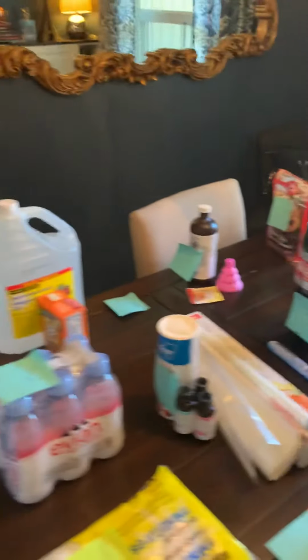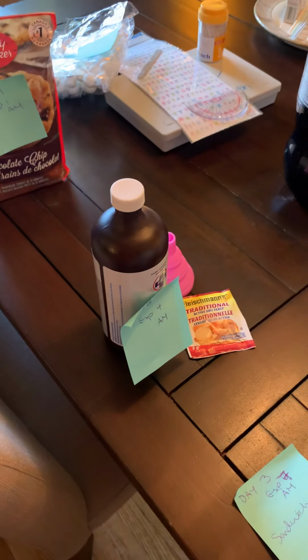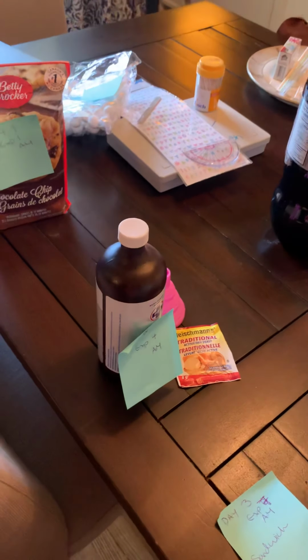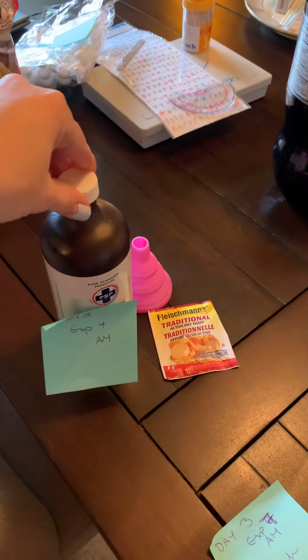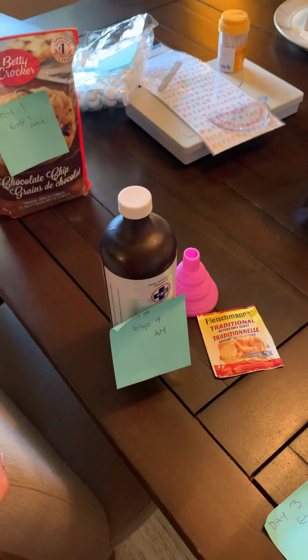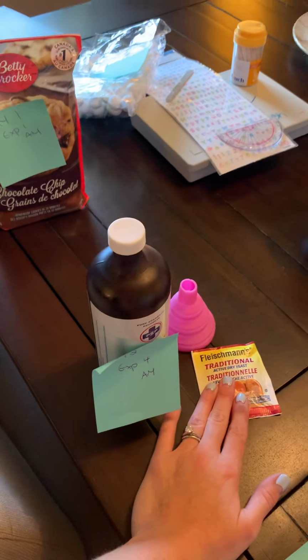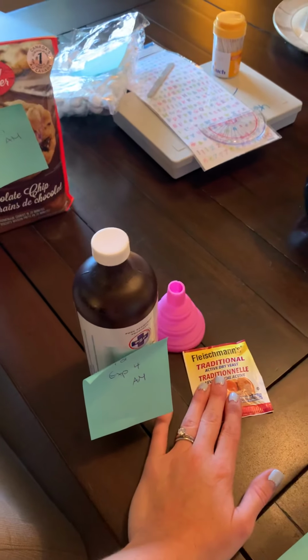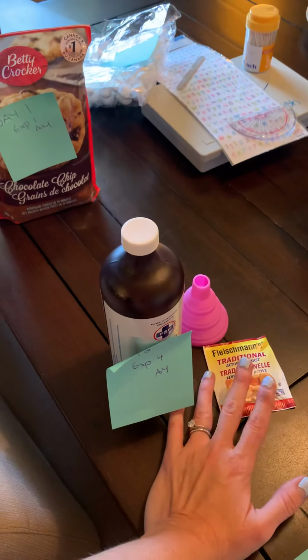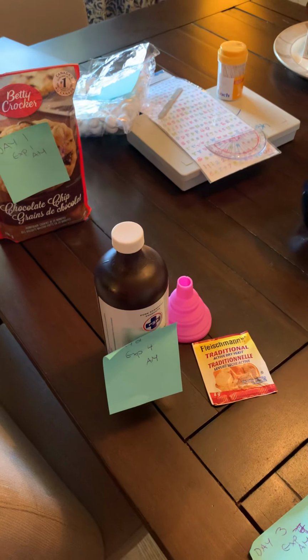And the second day we are doing, and these aren't everything, I just don't have all the materials yet. So this is elephant toothpaste. I don't have everything ready for it yet, but we're going to be using hydrogen peroxide that you can get at a pharmacy or grocery store. We're going to use yeast at home instead of the normal catalyst, potassium iodide, because it's easier to get. And we're going to add some colors and make a fun foamy explosion from some bottles.